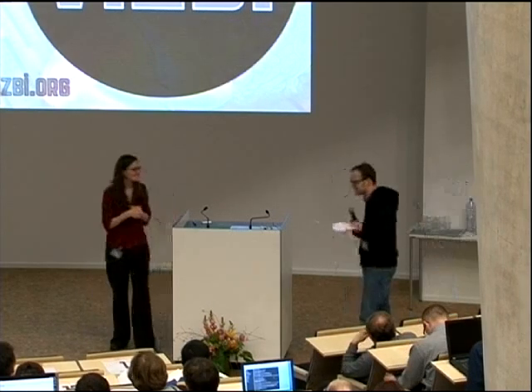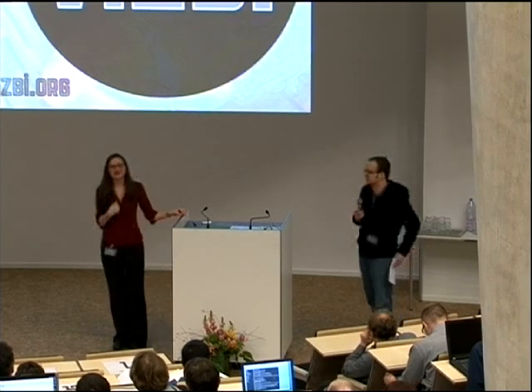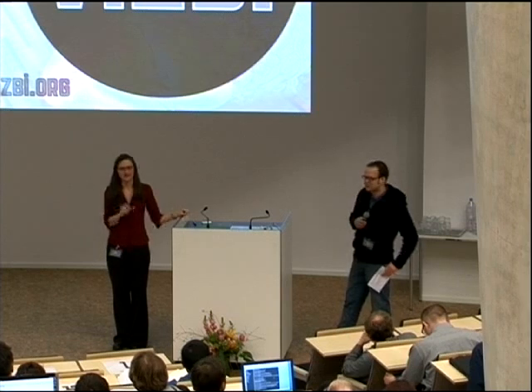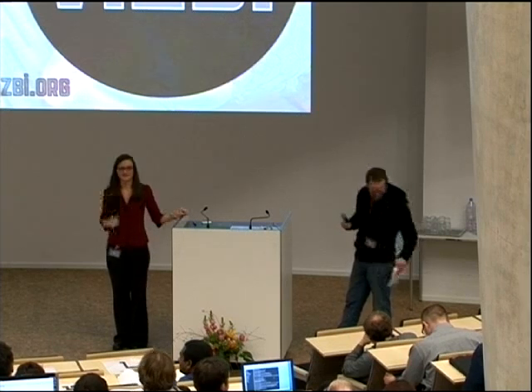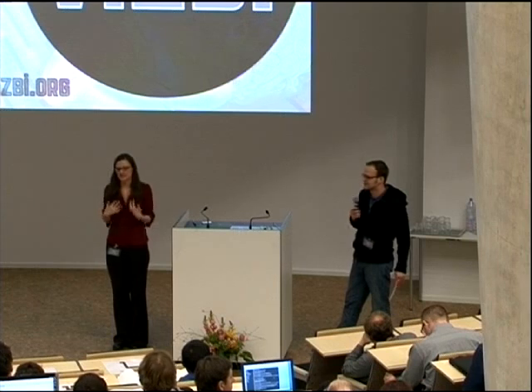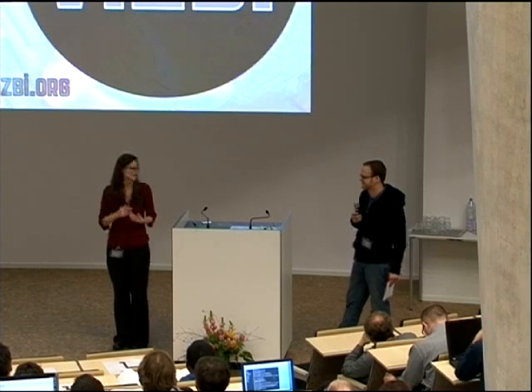So the question was if this can then be double-checked. The computer can draw our attention to things which then sometimes we can see, and that certainly happened to us in several cases. It's funny, because we spend so much time having us as biologists teach the computer, but then the computer teaches us what it is that we're actually looking for.